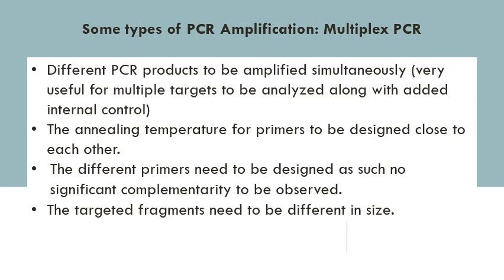There is what's called a multiplex PCR. A multiplex PCR is having many PCRs in one tube or one reaction. Let's say we designed a set of primers, forward and reverse. For example, if I have a strand of DNA, I need to amplify this region, and this region.